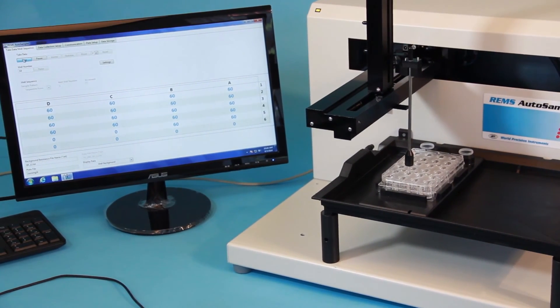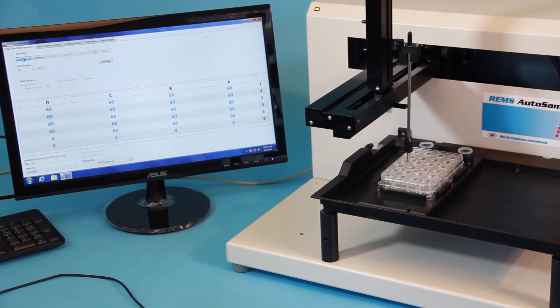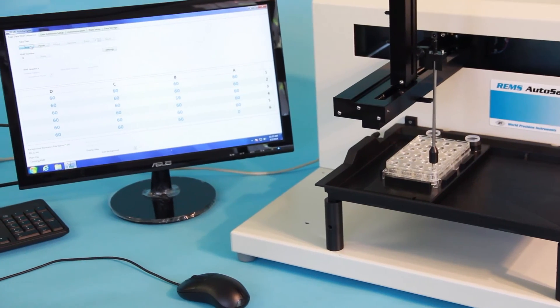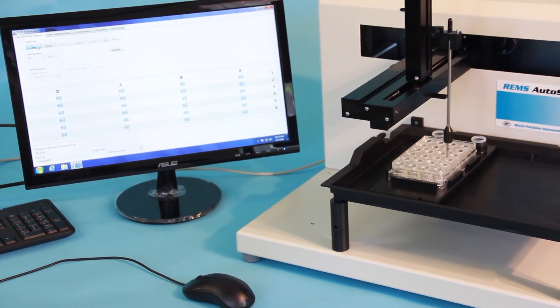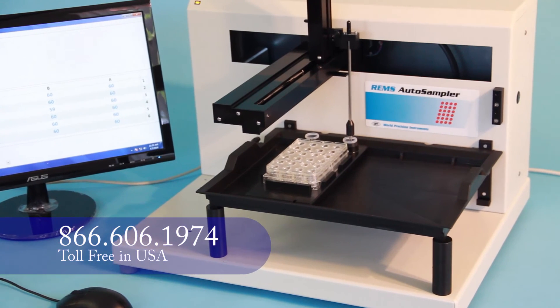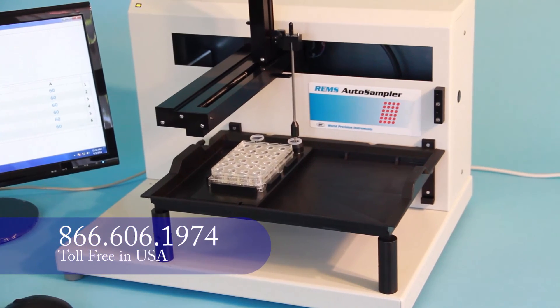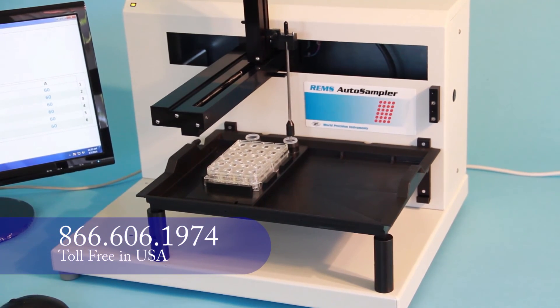So if you're looking for an affordable solution for automating high-throughput screening of TEER measurement, give me a call to talk about getting a REMS system in your laboratory today.